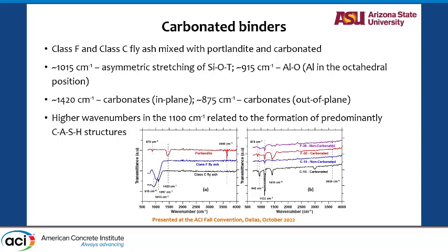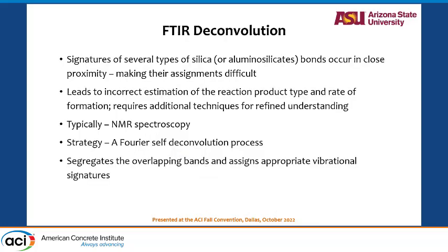to understand how much carbonate is formed. But the idea is that, again, this will require the operator to understand the material, and even when you understand, if it's a complex heterogeneous material, there are so many different things going on. Several types of silicates and aluminosilicates are there in many of those systems. Some of them, the bond energies are very close to each other, so the peaks appear very close to each other, sometimes broadening the spectra like you're seeing, right? Even the energy is never sharp in any of those spectroscopy techniques, because what you are getting is generally an overlap of many different processes. So that sometimes could lead to incorrect understanding.